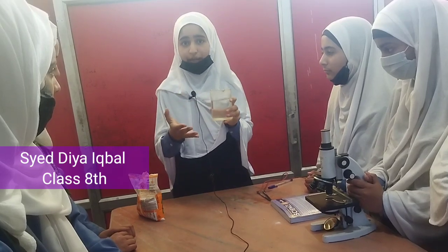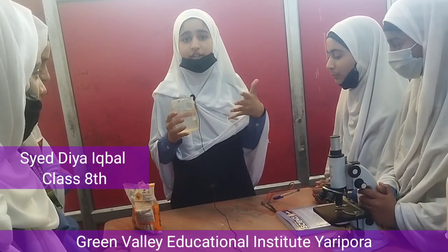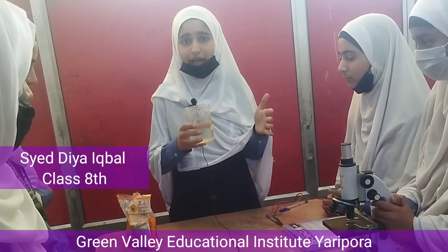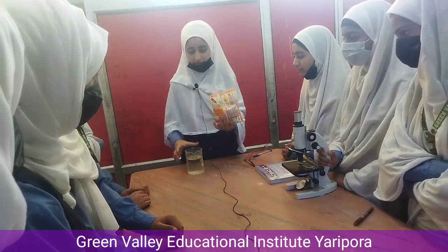But you may know that electrolytes are mainly 2 types, strong and weak. Strong electrolytes contain a lot of ions, so they are very good conductors of electricity. But weak electrolytes don't contain a lot of ions. They are weak conducting liquids. So to make it more conducting, you can add any acid, base or salt in it, just to make it more conducting and increase the number of ions in it. So here I will add some salt in it.